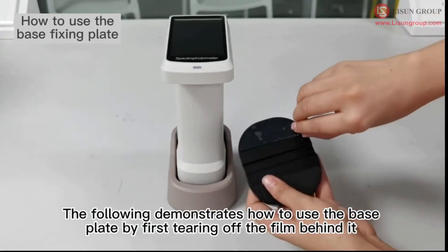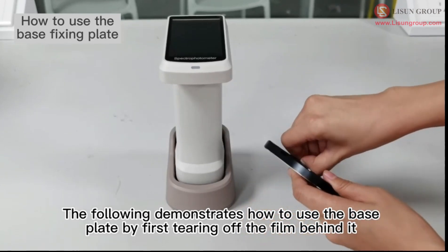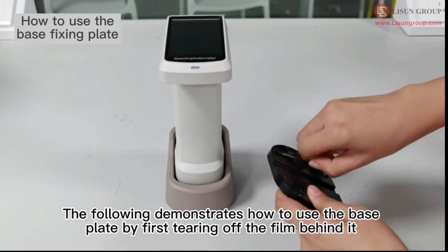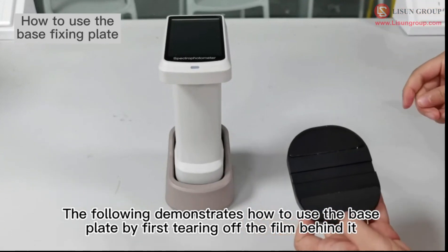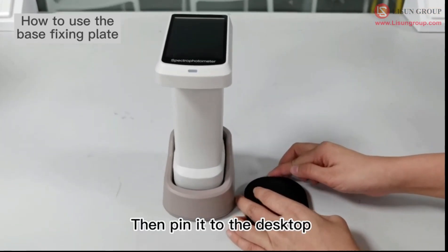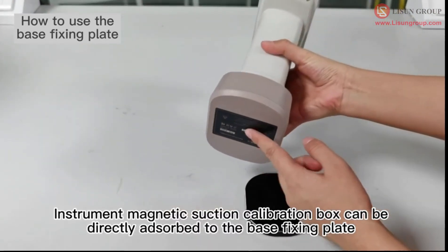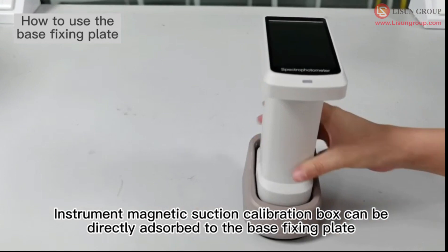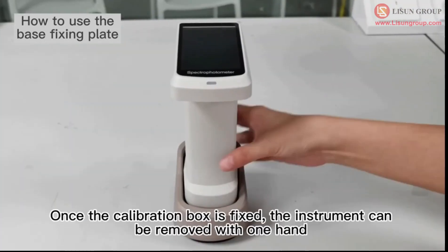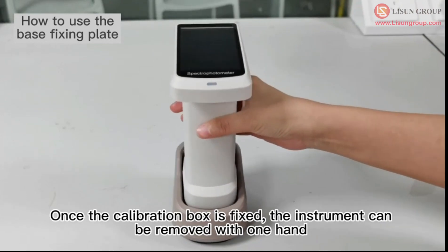The following demonstrates how to use the base plate by first tearing off the film behind it, then pinning it to the desktop. The instrument's magnetic suction calibration box can be directly adsorbed to the base fixing plate. Once the calibration box is fixed, the instrument can be removed with one hand.